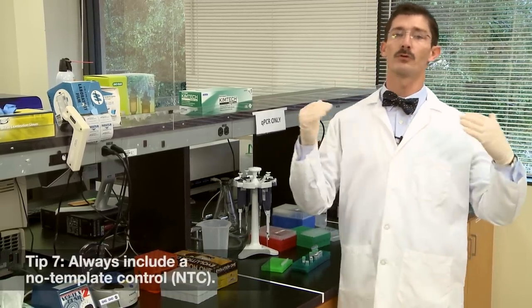And finally, remember to always, always include a no template control. Contamination will happen, and the only way you'll know it is by using an NTC control in your plate.